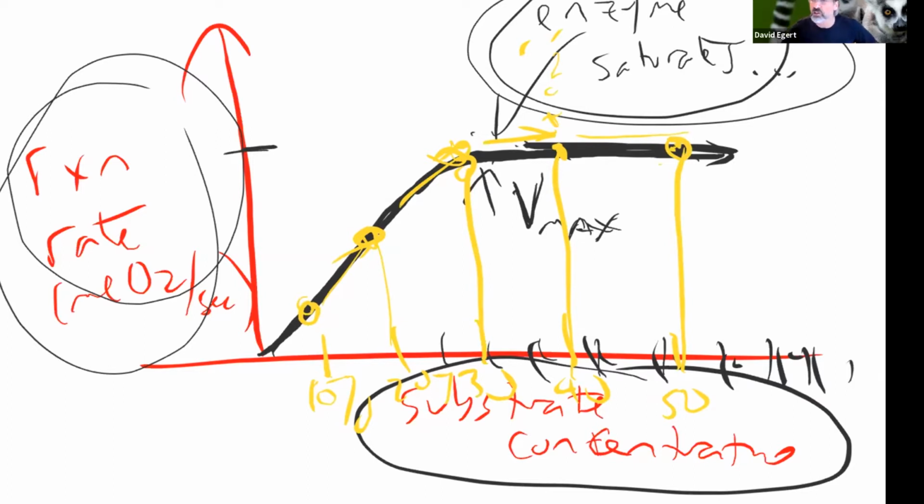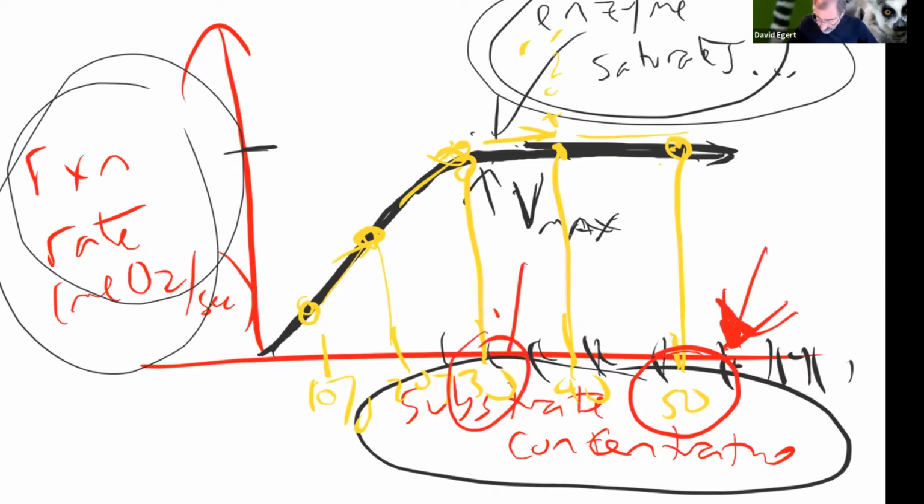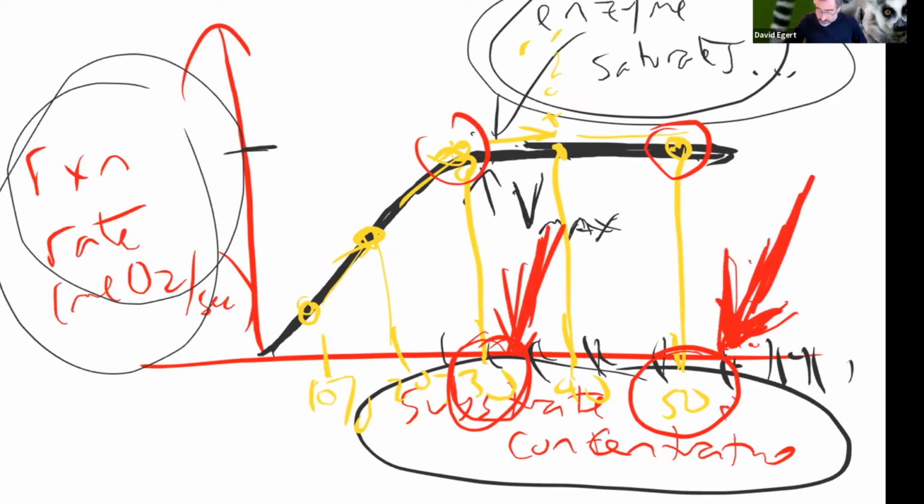What about just the sheer amount of oxygen? If I run the experiment with higher concentration of hydrogen peroxide, even if the rate is the same, I am going to have more hydrogen peroxide to break down, right? So what am I going to see different in my experiment if I'm actually running the experiment at 30% and at 50%, and even if I'm at saturation, how are the experiments going to be different when I actually run it? Or how is the run going to look different?